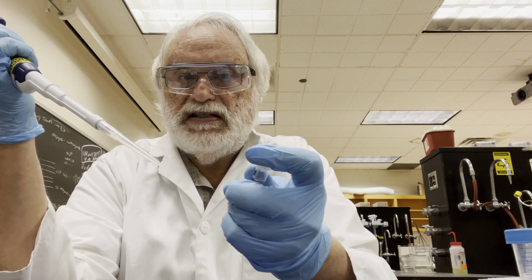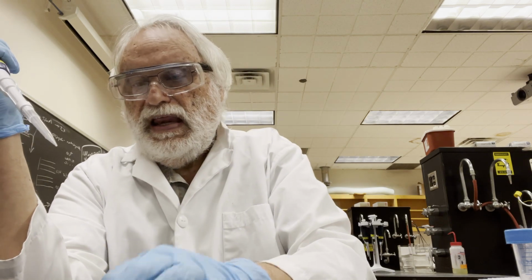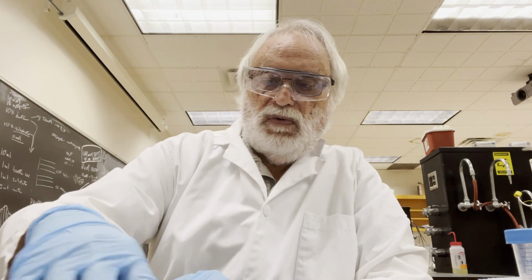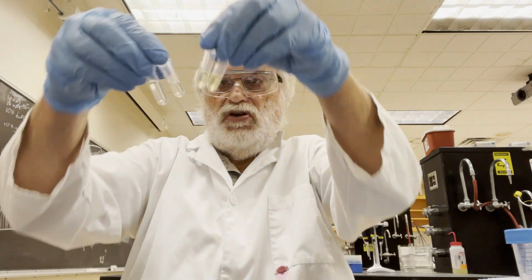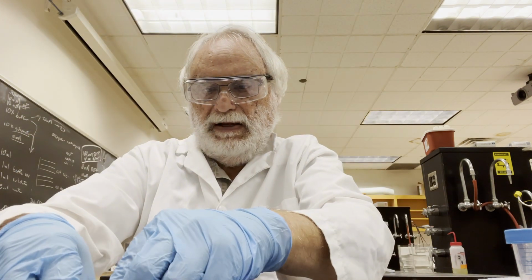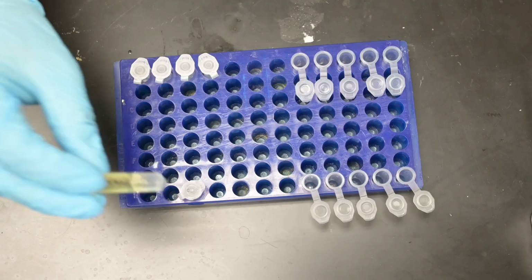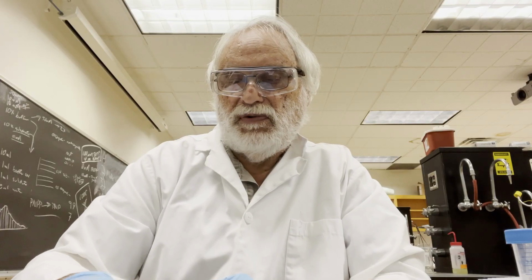This one we don't have to take out because it's the last tube. So now we have the first part set up where I have 4 tubes at different concentrations of PNP. And I have the more concentrated one. I'll go ahead and put this right alongside it. So there's the 5 samples set here.